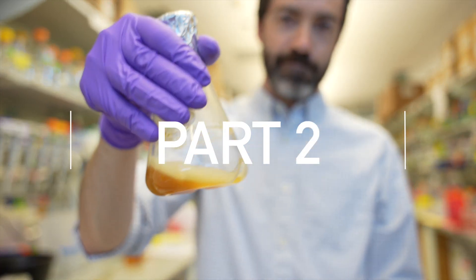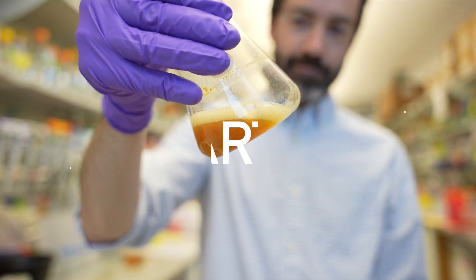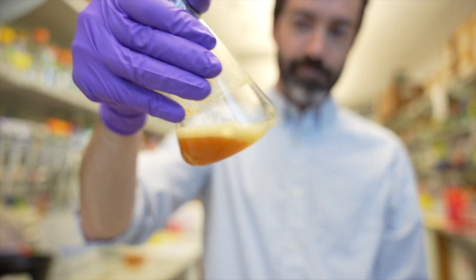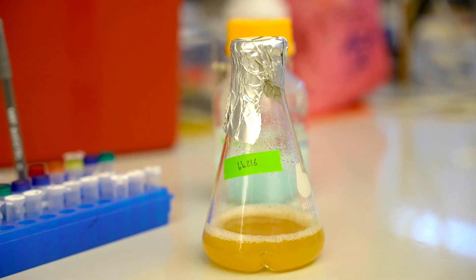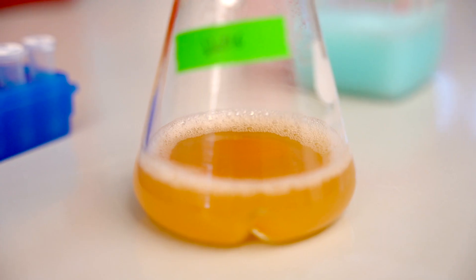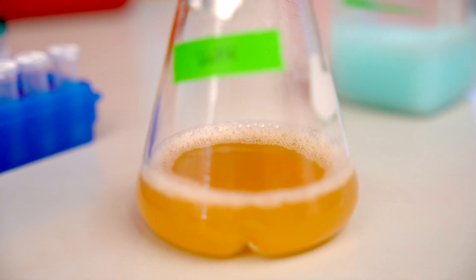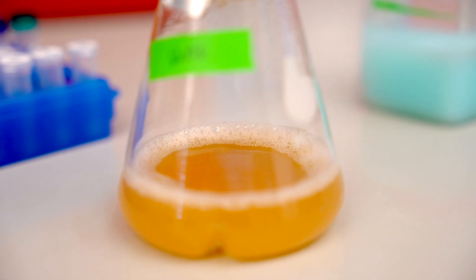For part two, we're starting right where we left off, with a flask full of billions and billions of cells. These bacterial cells have been growing and growing and producing tons of the protein that we want to study. But before we can run any tests on this protein to figure out whether it's folded or whether it does what it was designed to do, we first need to purify it.